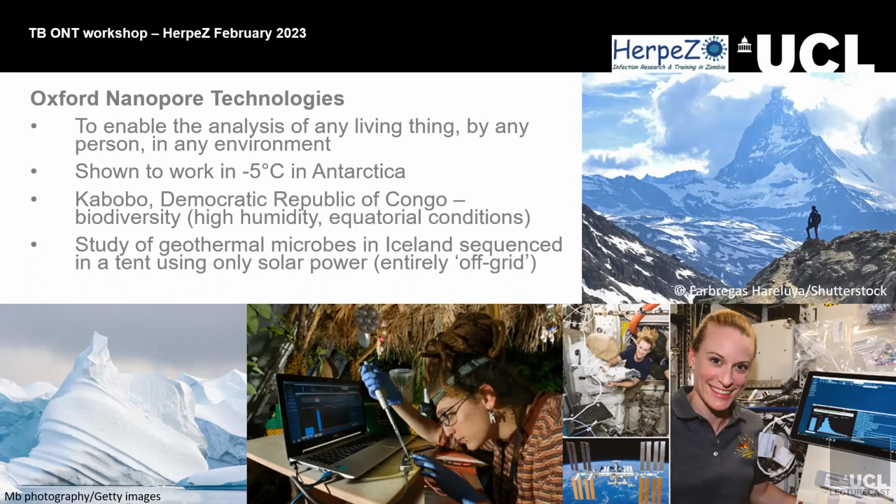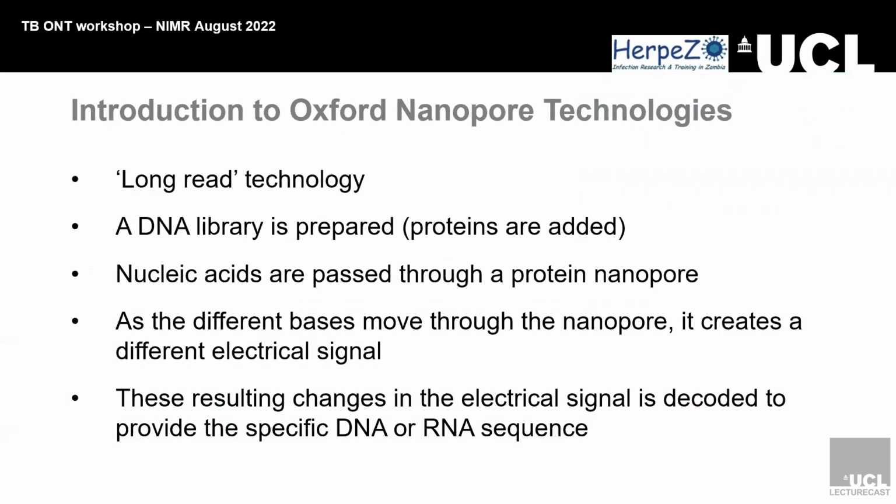So if you're doing a whole lot of samples, then an Illumina kind of makes sense, because you're spreading that cost over a larger number of samples. But if you're using a small number of samples, for example, we've got 12 barcoding kits and 96 barcoding kits, you would use an Oxford Nanopore. And with Oxford Nanopore Technologies, we use long reads. Whereas Illumina has short 600 base pair reads, we do thousands of base pairs.